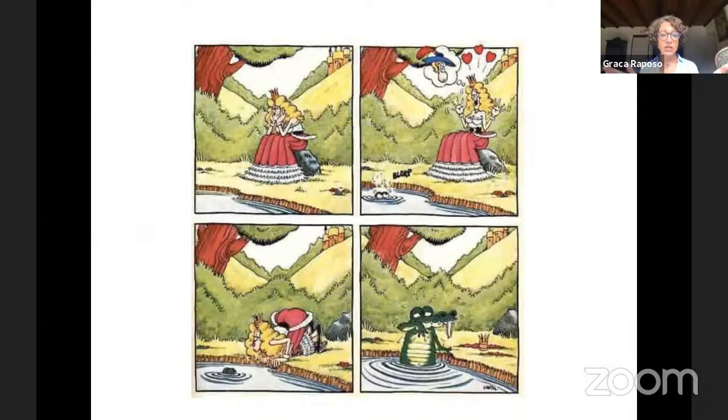So when we have a positive result, we are always careful in trying to understand if this is real, if the antibody works. You really need to know the biology of your antigen and of your antibodies.